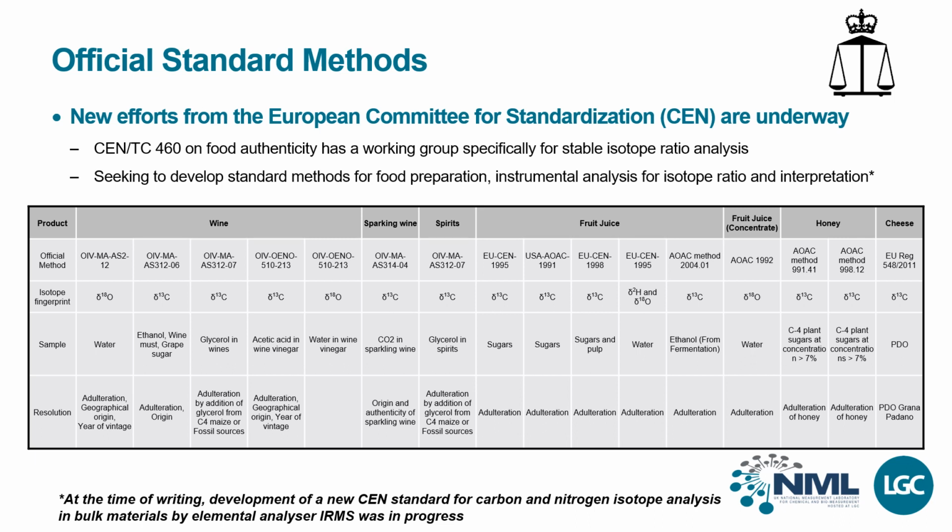These methods have usually been collaboratively tested and have standard method performance criteria. The majority are also referenced in International Codex Standard 234 for methods of analysis and sampling. For enforcement work, it is preferable to use officially recognized methods.